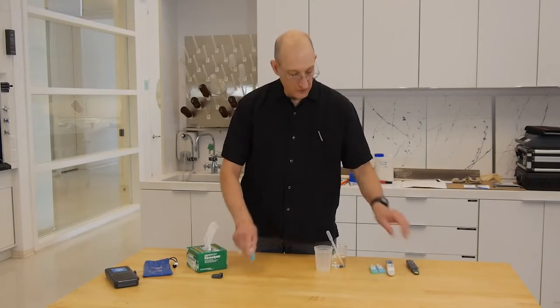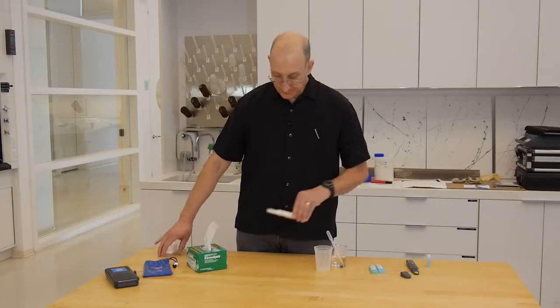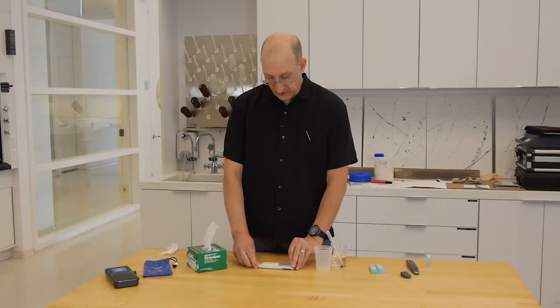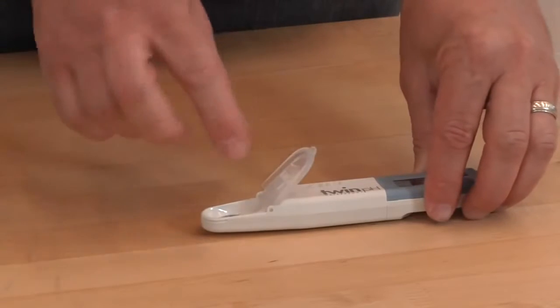For the pH meter, it's more or less the same process, except we're going to calibrate to two points. Again, we turn the meter on and we open the sample well.